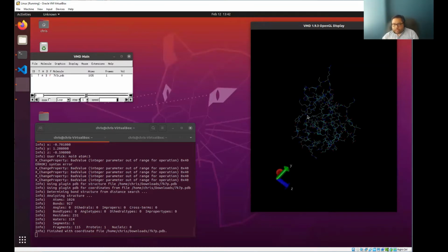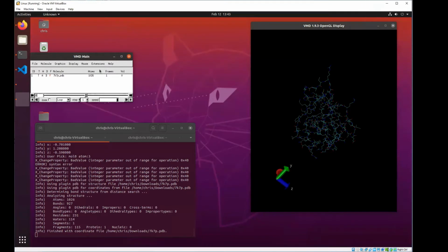Now we're going to move on to more advanced topics that we were discussing earlier, which was NAMD, that other program we had you download. As Dr. Valfar said, it's basically an add-on program that works in parallel with VMD. NAMD is more the calculatory side that does most of the calculations for things like bonding energies, whereas VMD is just the visualization tool. So we'll load the file into VMD, but we're going to send our information to NAMD to do the calculations, which will then shoot it right back to VMD to show us the actual visualization of what's happening, right?